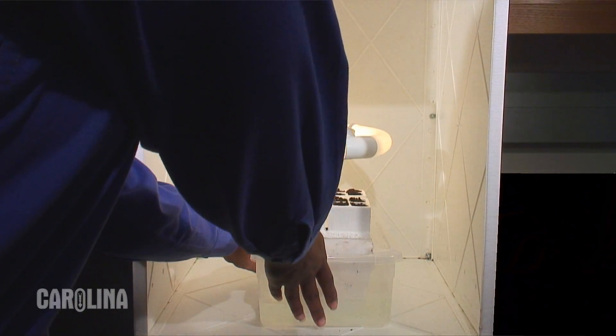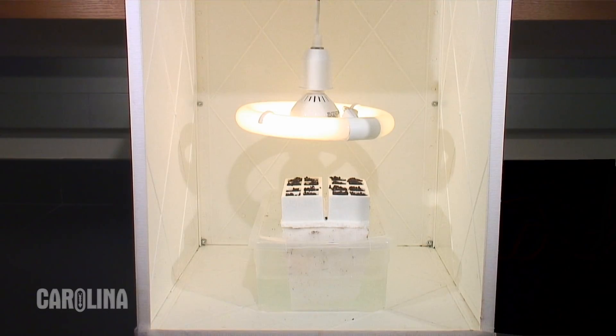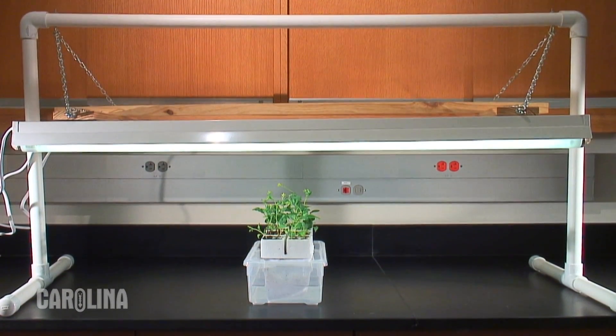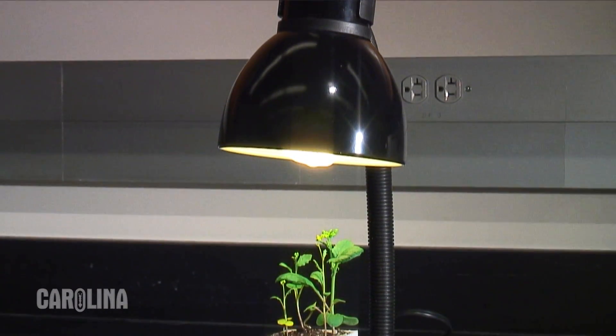Place the planted quads under lights. You can use the plant lighthouse, a plant light system, or an individual plant light. The plant lighthouse is great for small quantities of plants. The plant light system is great for large quantities of plants without taking up a lot of space. The individual light is ideal for classrooms with limited space.